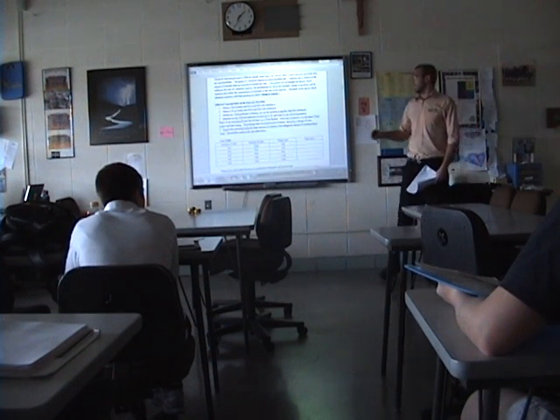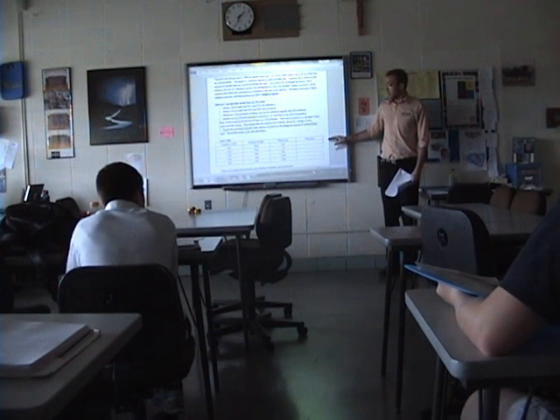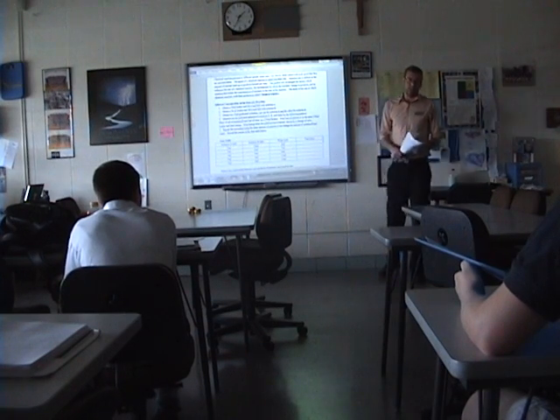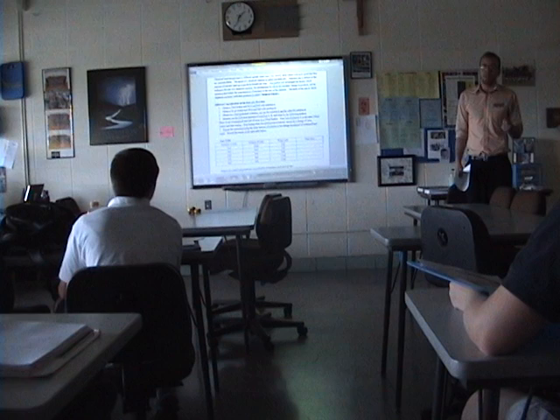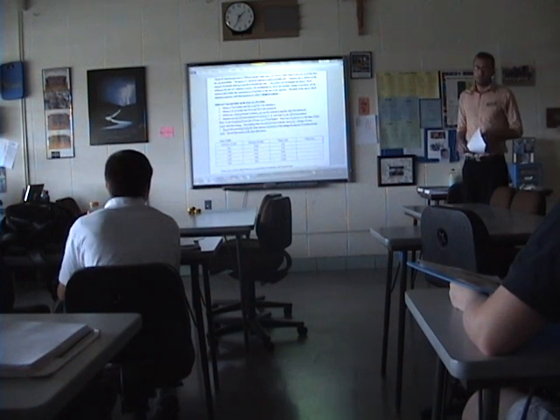So what do you guys think is going to happen for this first one? Right away, it's going to happen right away. And as it goes down, what do you think is going to happen to the reaction rate? The time. Exactly. So for that first one, you guys have to be pretty quick with it. It's going to happen pretty quick. All right, so you guys have any questions on that first one? It's pretty straightforward.